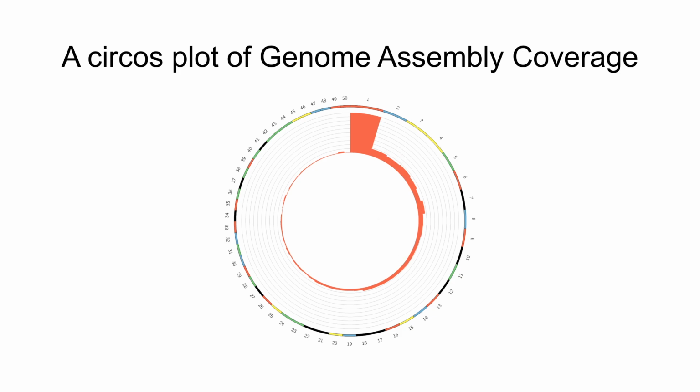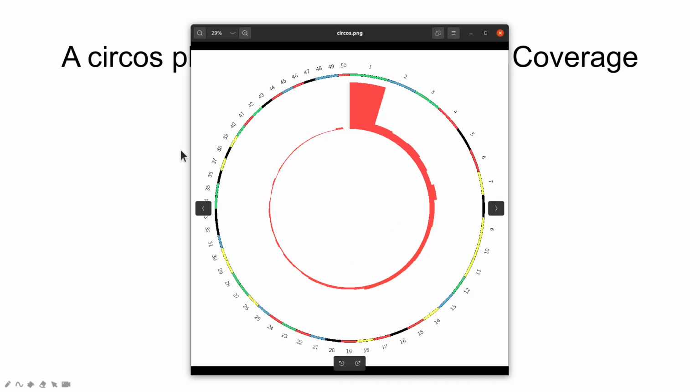So what we are going to do next is add these lines to it. And then we are done. So let's look at that. I'll go back to the command line and then I will do the editing. Okay, so let's get back here.